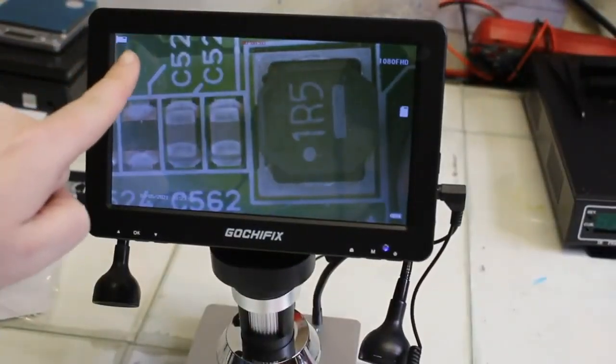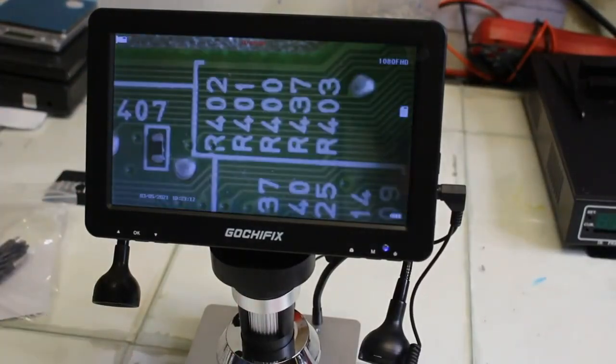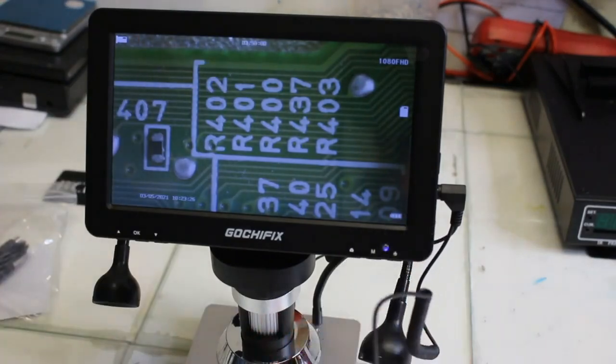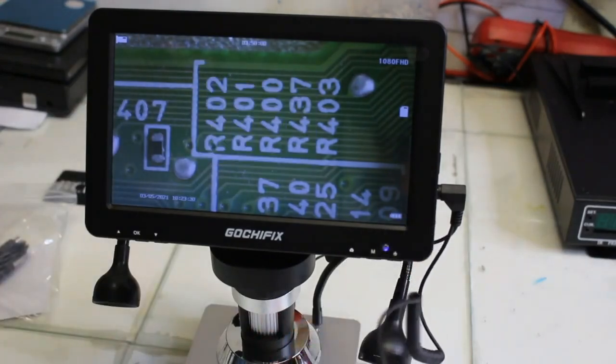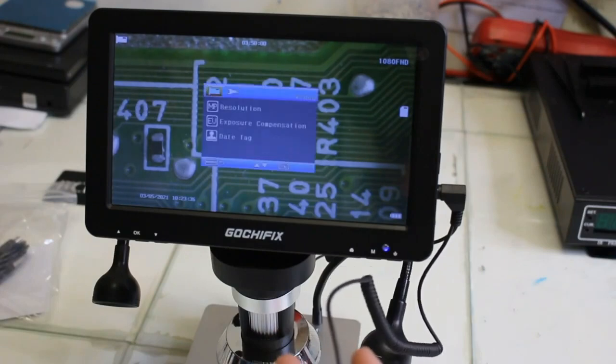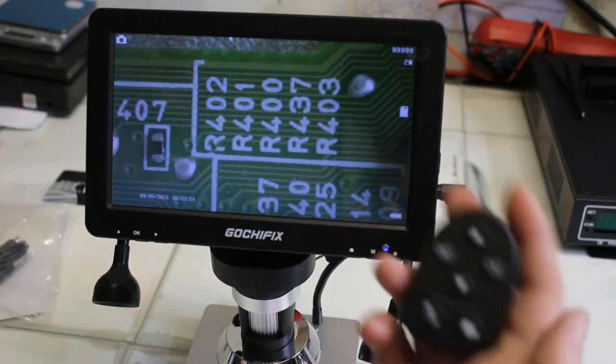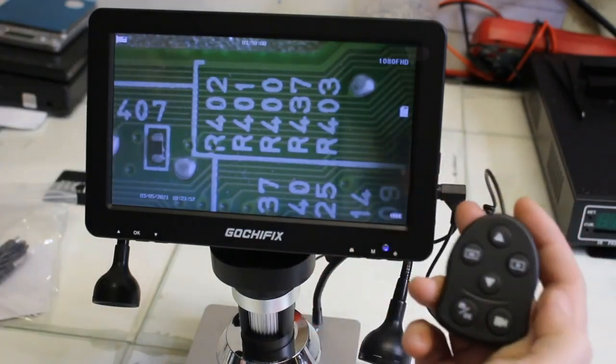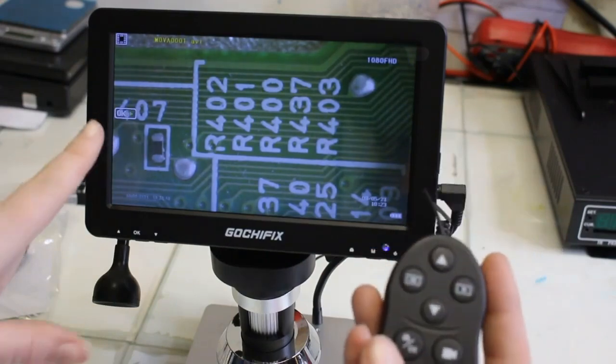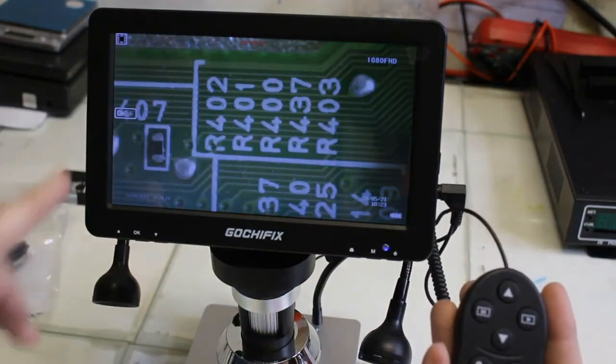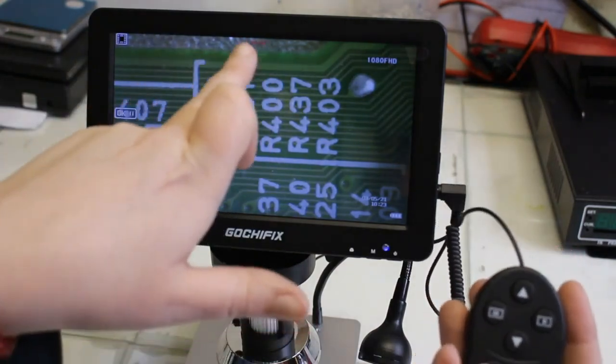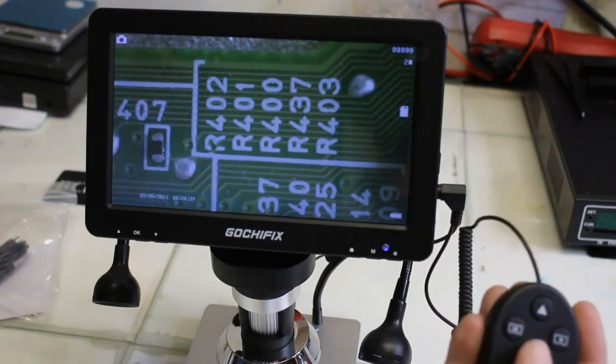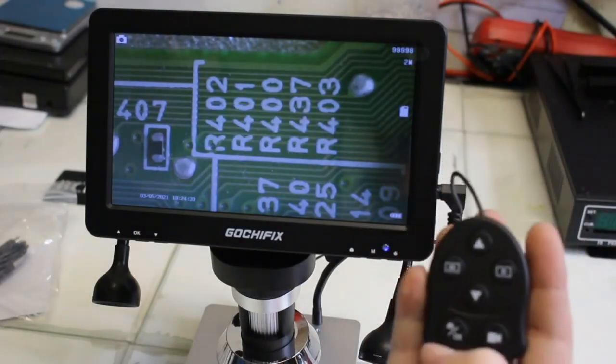So now up here in the corner I'm trying to show you we're taking a video at this moment and you can see in the middle at the top it was in red. I've paused it now it's white. Now I'm going again we're recording, we see the red dot by the video and the numbers were red so it's paused again because it's white. I'm figuring it out with the manual. When we see the camera we know it's a picture right? So here I push that play button or I'm going to call it the movie button. So you see here I'm actually in a video format but here I can pause it and then start the video again.